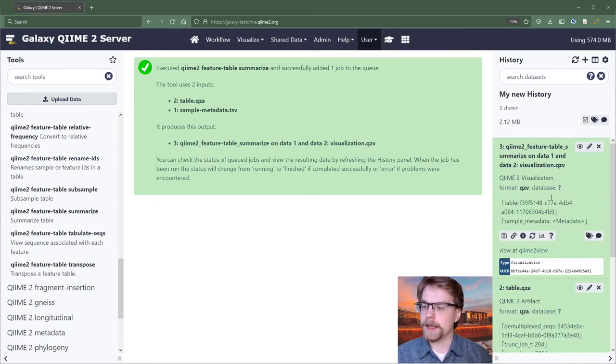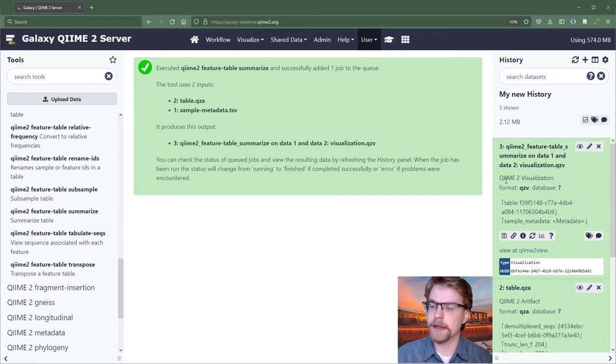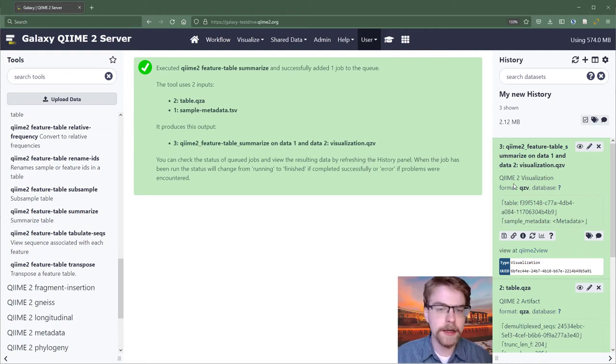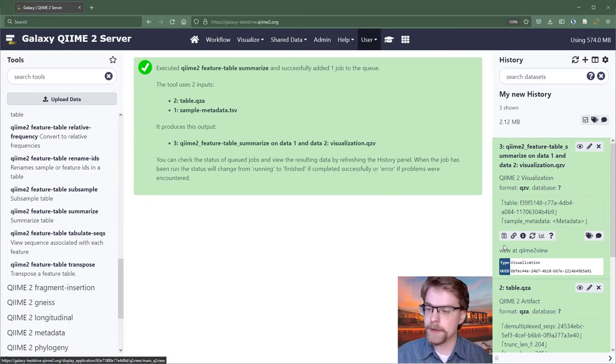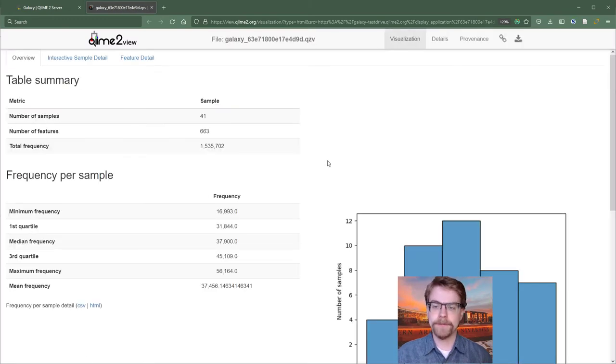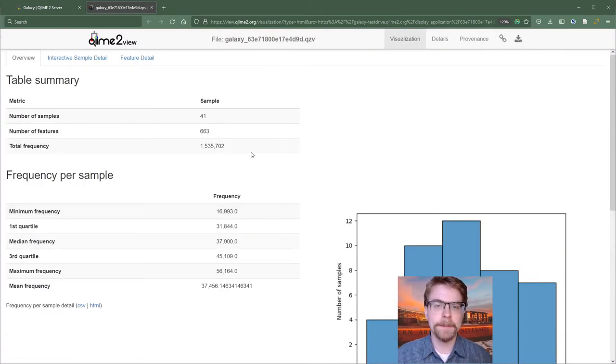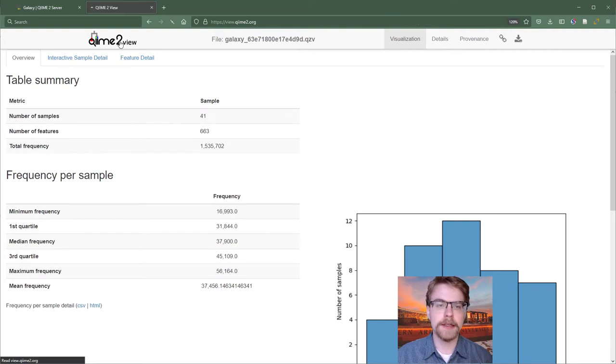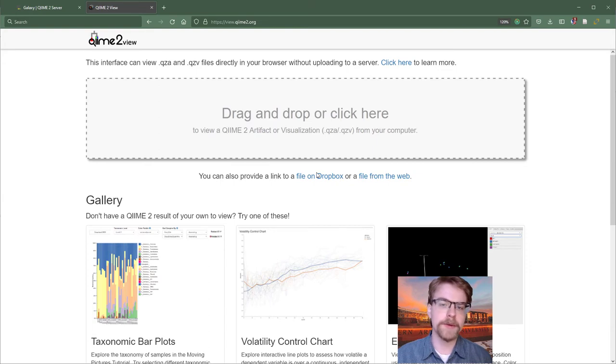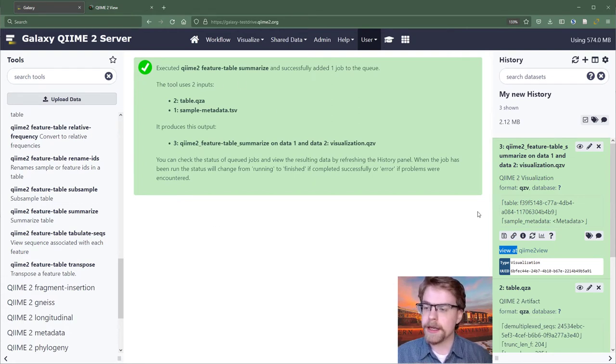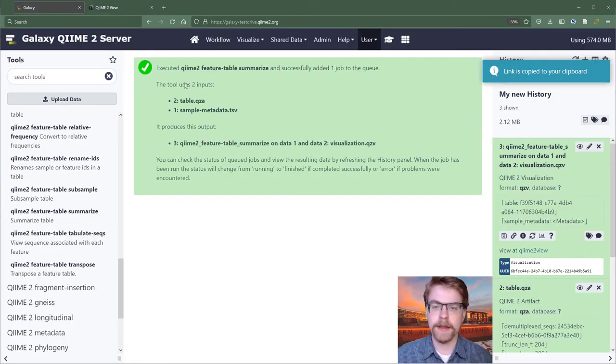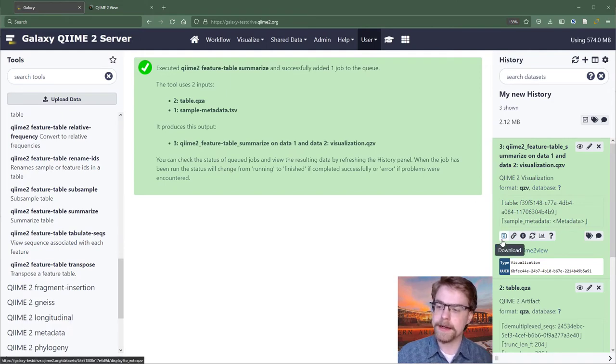While that's running, there it is. So expanding this, we see this particular result is a QIIME 2 visualization. What that means is it contains some kind of human readable summary of information. It's not just data itself. And so we can click this very important view at QIIME 2 view link to see what's in there. And so this is an example of a visualization. QIIME 2 view is a web application that works in your browser and can download data from elsewhere on the Internet or from your computer if you drag and drop. And so since this Galaxy server exists on the Internet, it can create URLs, which can be used in QIIME 2 view. And that just happens automatically. So you just click view at QIIME 2 view.